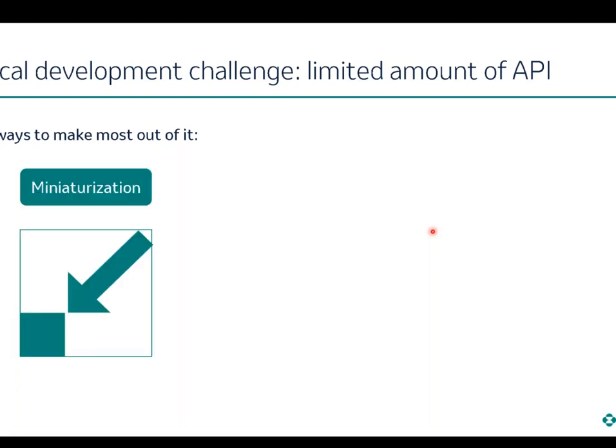One is miniaturization. We reduce the size of the reactor such that, although we work at very small scale with small quantities of API, we still get a mostly representative outcome of the process. Already with stirring this becomes an issue, because below a certain scale overhead agitation is rarely available.